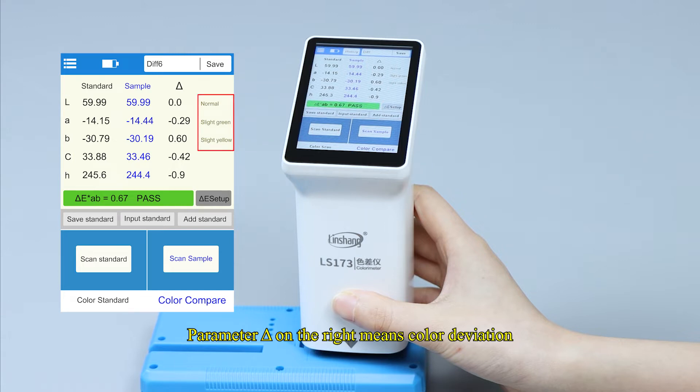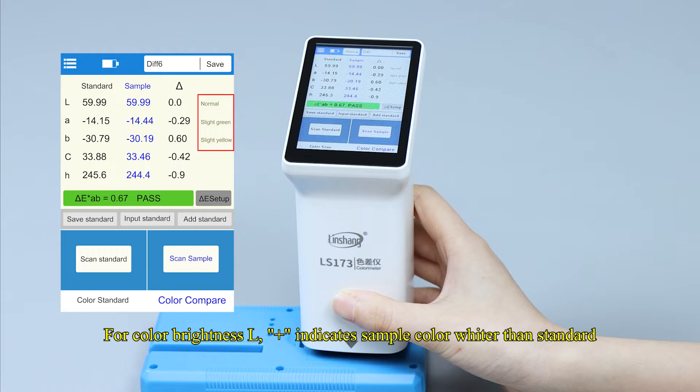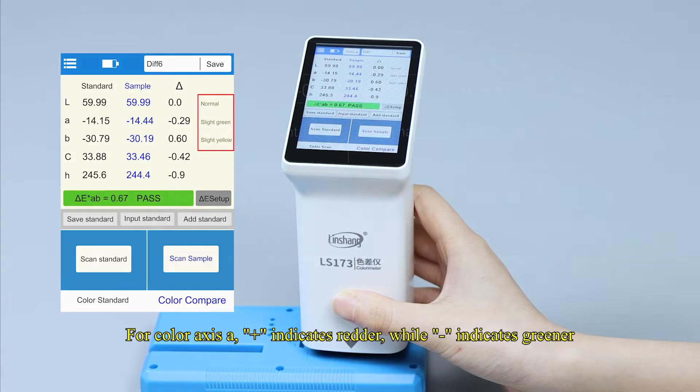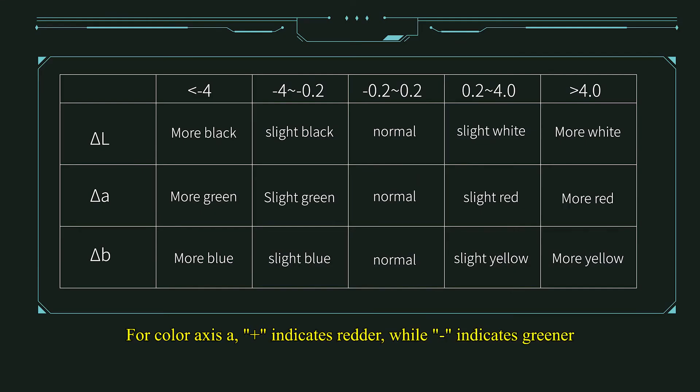Parameter delta on the right means color deviation. For color brightness L, a positive value indicates sample color whiter than standard, while a negative value indicates sample blacker than standard. For color axis A, a positive value indicates redder, while negative indicates greener. For color axis B, a positive value indicates yellower, while negative means bluer. The color indication is for reference only and cannot be used for color correction.